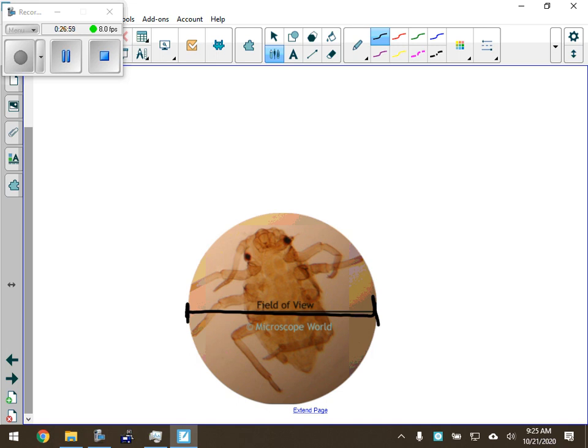I'm going to tell you right now, when we go to the lab, our eyepiece is 10 times. The first objective is 4 times. So you are magnifying something 40 times. I'm pretty sure it's 4. Once you figure out what that field of view is, which we're going to do in our first lab, it's always the same. It can't change because we're stuck at 40 times. Whatever you decide on day 1, that's how much space you see. There's no varying there.